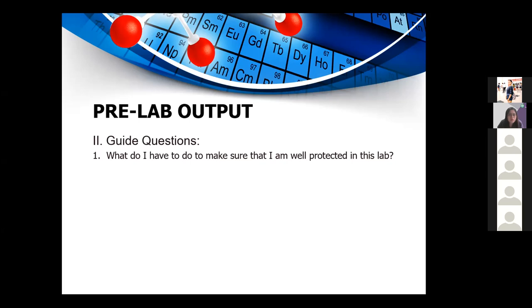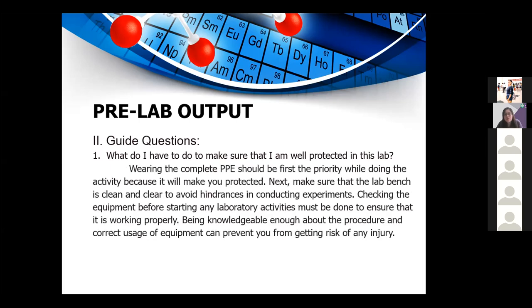Question 1: What do I have to do to make sure that I am well protected in this lab? Wearing the complete PPE should be the first priority while doing the activity. Make sure the lab bench is clean and clear to avoid hindrances. Check all equipment before starting to ensure it is working properly. Being knowledgeable about the procedure and correct usage of equipment can prevent injury.